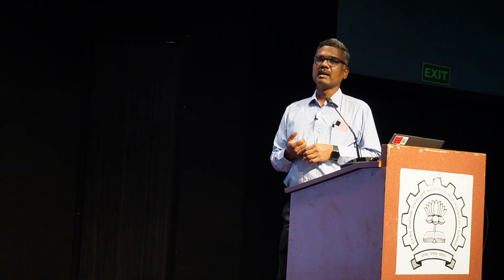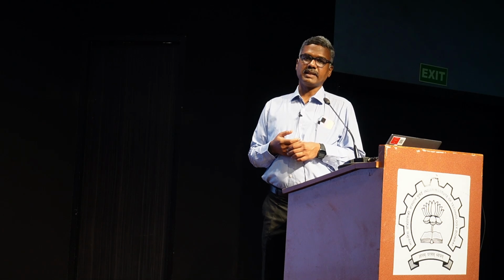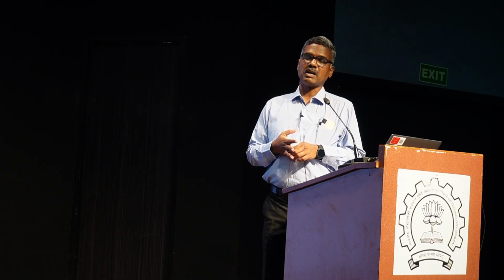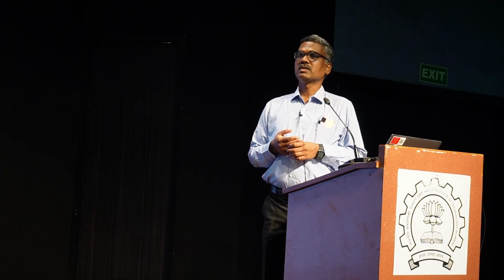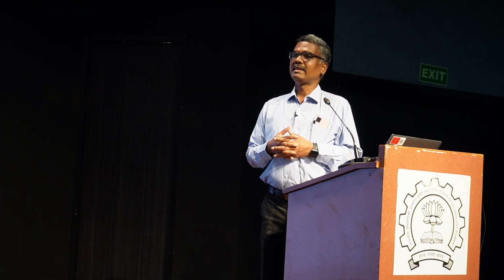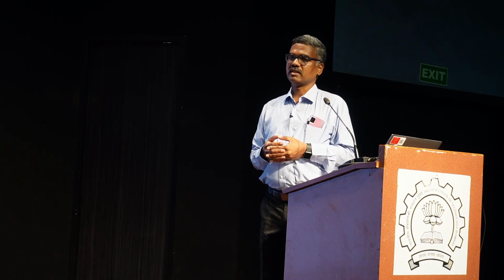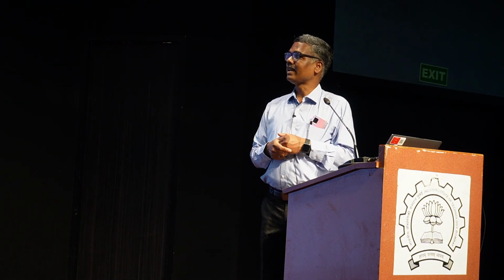Second thing, basically when we are expecting multiple objectives in one approach, then we need to be sure about the confidence level of the repeatability of the data. That is also one important aspect, how robust the data looks. Because if we are saying that today I got that information but tomorrow I am not sure, that should not happen. Today you got it, and you should at least get continuous results to give to your colleagues or any other location also. Then only your data is considered as robust data. It is not like having a lot of uncertainty. So robustness of your data is very much important.